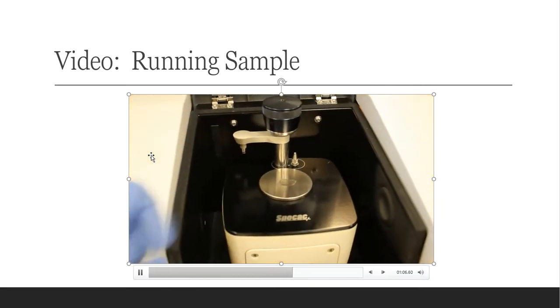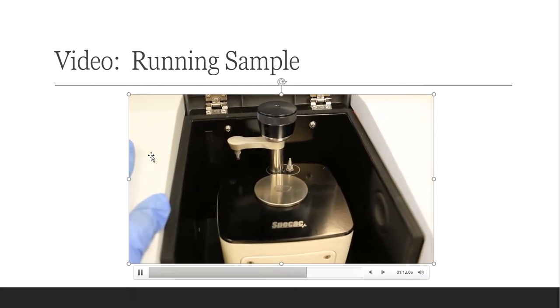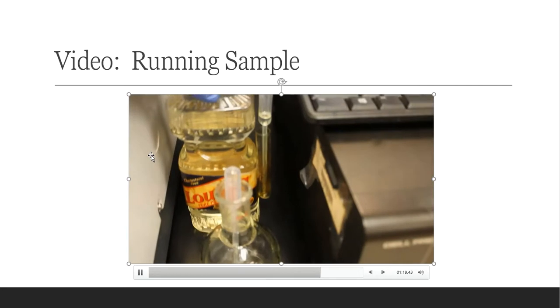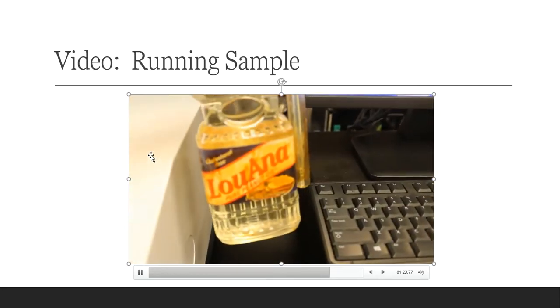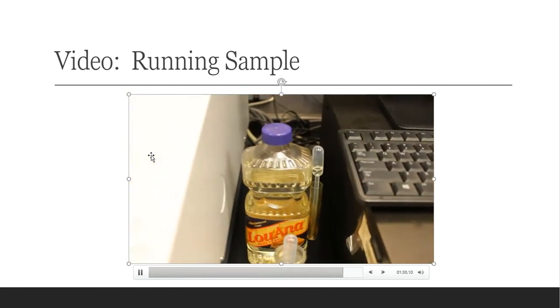But here you see the ATR attachment. The ATR attachment has a few drops of liquid on the plate that's there at the very top. Right now, this is my sample, so this is what's coming from my flask, but I'm also going to run the Luana pure peanut oil as well to see if I can get a difference between the two. So we ran it with refractive index, and we'll do the same thing with FTIR.